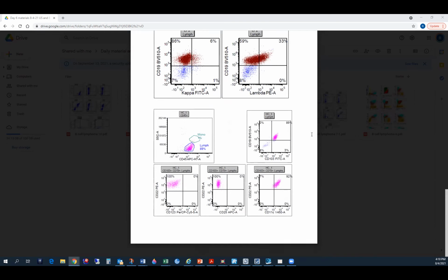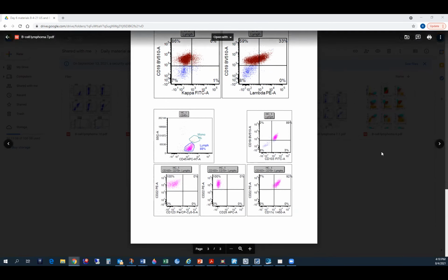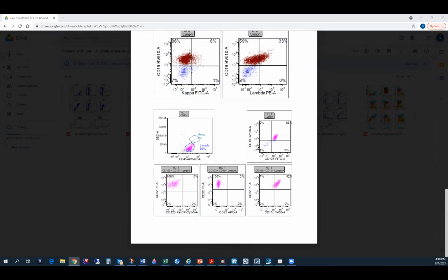And when we go into the hairy cell tubes, it is positive for CD103, CD22 and CD11c, and those are towards the brighter end, which is good. That's what we want for CD11c, bright. In hairy cell it is usually bright. So I would call it hairy cell leukemia by immunophenotype, I think.